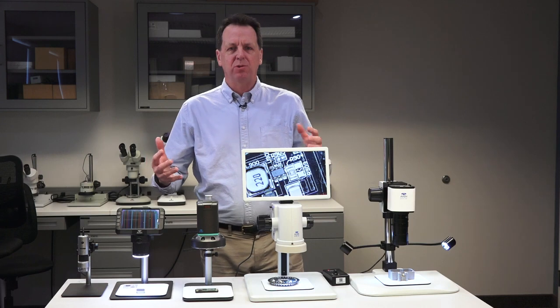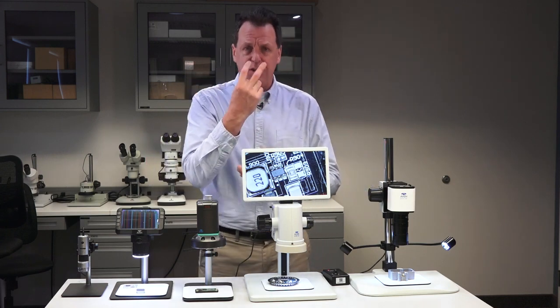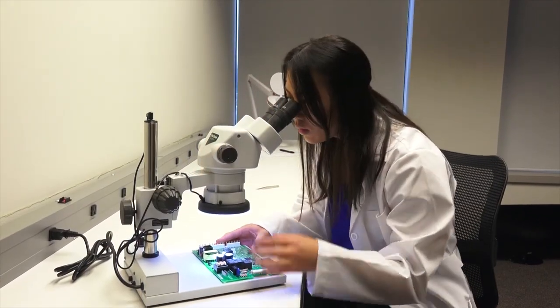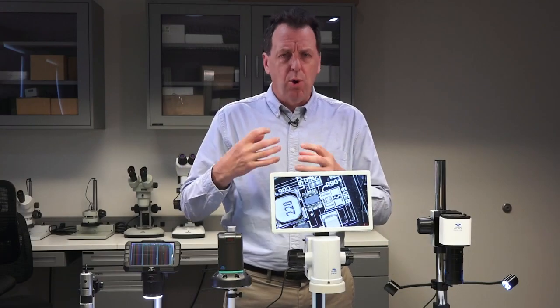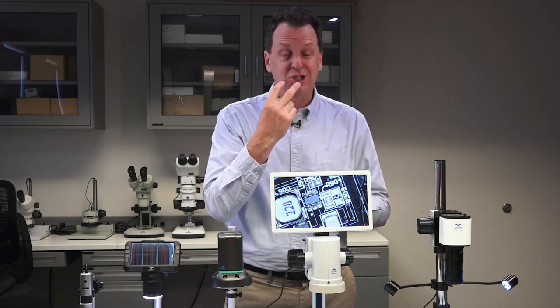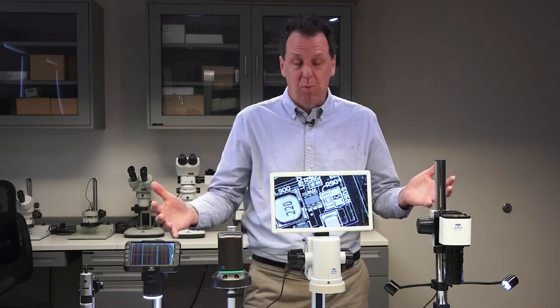What is a digital microscope versus a regular microscope? Let me just give you a quick scenario. A regular stereo zoom microscope is a great way to take a look at an object under magnification where you get a three-dimensional view. But if you wanted to capture images or record any movies or do any measurements, you cannot do that with a regular stereo zoom or binocular microscope. You're going to need to have a digital microscope.